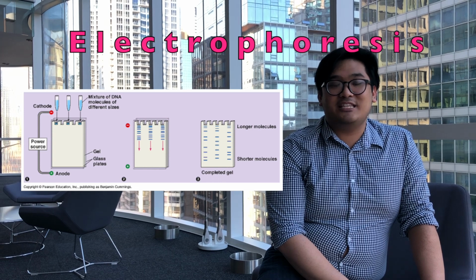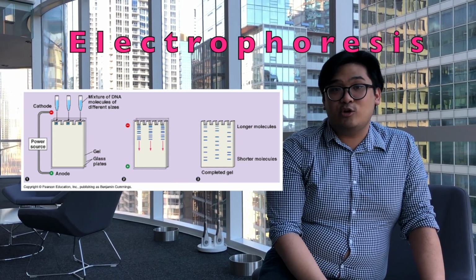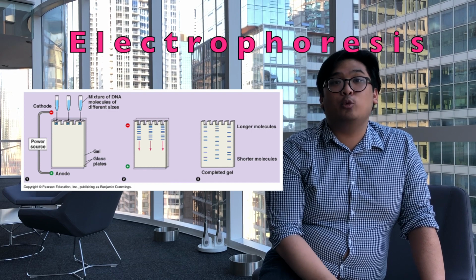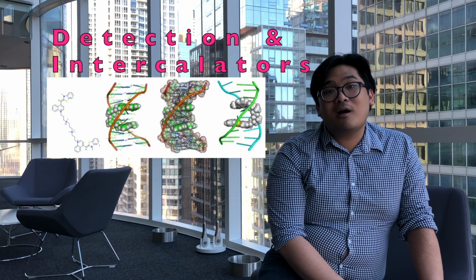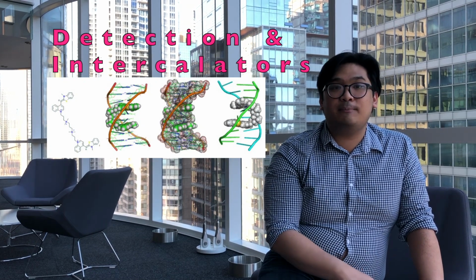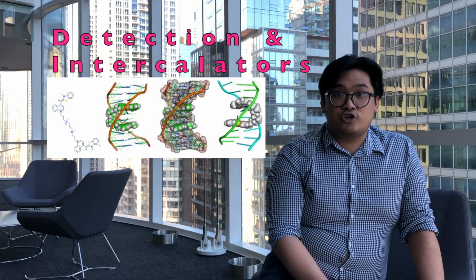So after PCR, the amplification of your gene of interest can be seen by separating out your PCR products on an agarose gel. DNA, which has a negatively charged phosphate backbone, will move from the cathode to the positively charged anode. Ethidium bromide or SYBR Green can intercalate between the bases to allow for fluorescence-based detection. So a lot of your larger fragments can be seen at the top of the gel, whereas your smaller fragments will be closer to the bottom of the gel.